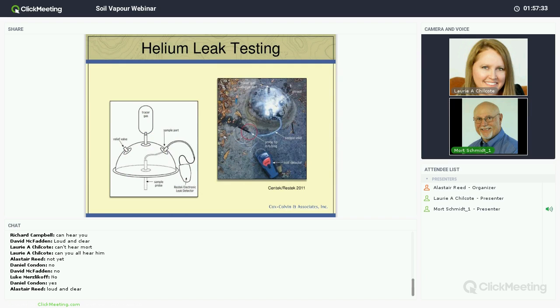Now, one of the issues with soil gas sampling is that there can be a lot of hardware hooked together, and there's a tendency for leakage. There's also a tendency for leakage of subslab sampling points, especially in my experience and most people's experience, I think, is when you have the cemented endpoints. They tend to break loose, etc. So you want to make sure that when you're collecting soil gas, you're actually getting soil gas and not indoor or outdoor air. So you test for leakage.